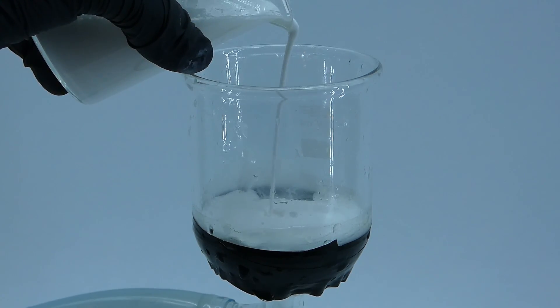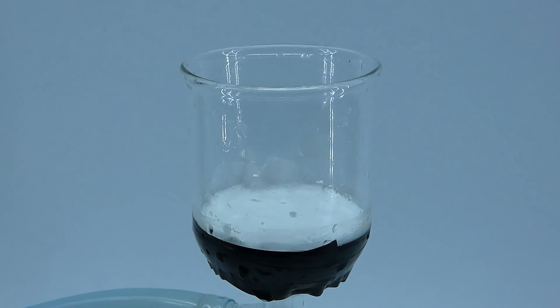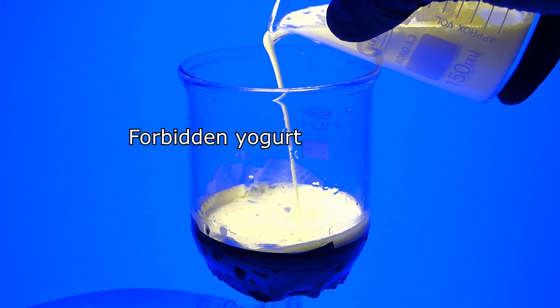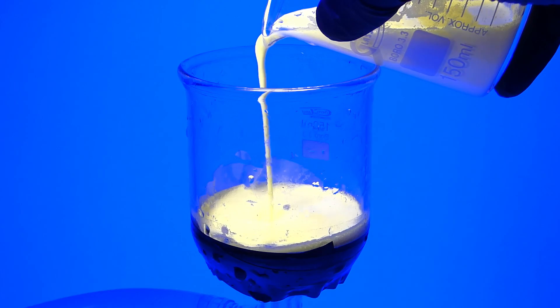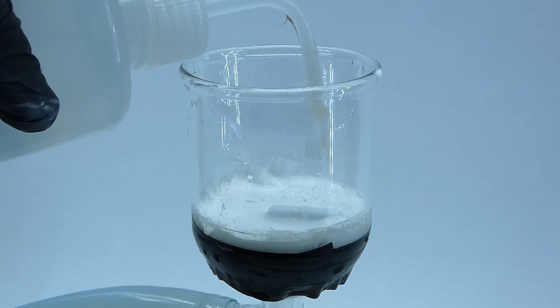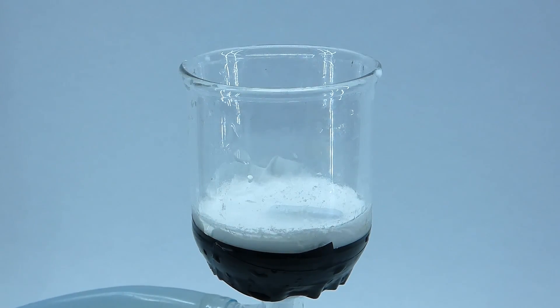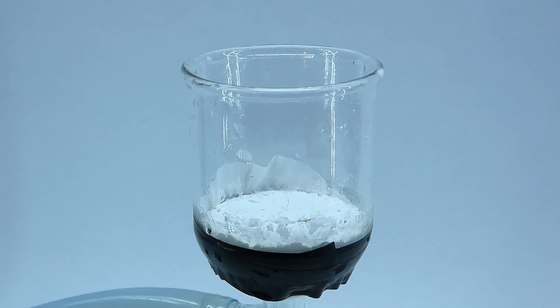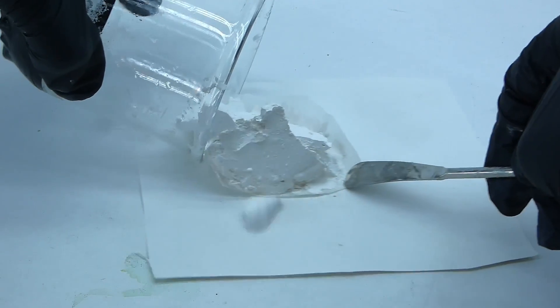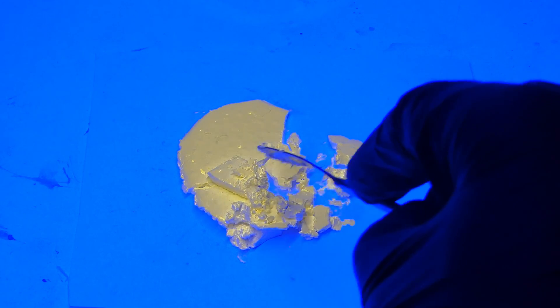Now, to separate and purify the complex, I vacuum filtered it, and under UV light, it looked pretty incredible. I then washed it with a lot of water to remove any impurities, and after drying it on the filter for a while, I got it out onto a piece of paper and broke it into many small pieces, which also looked very nice under UV light.